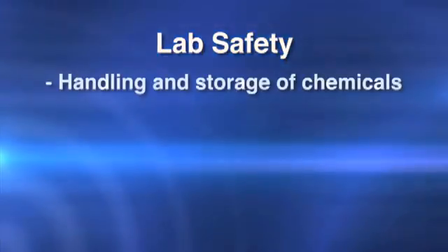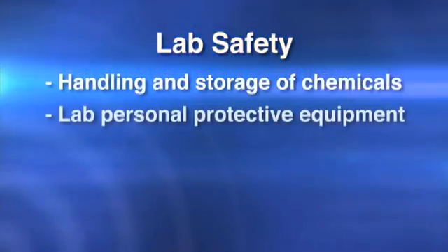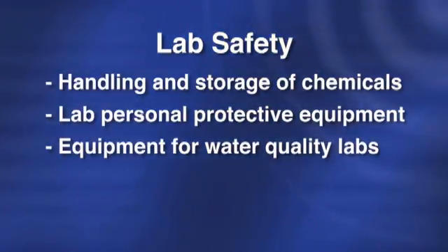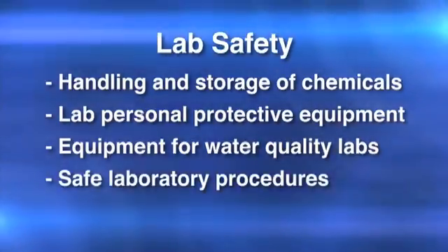We'll look at 4 major areas of lab safety: the handling and storage of chemicals, lab personal protective equipment, equipment used in water quality labs, and safe laboratory procedures.